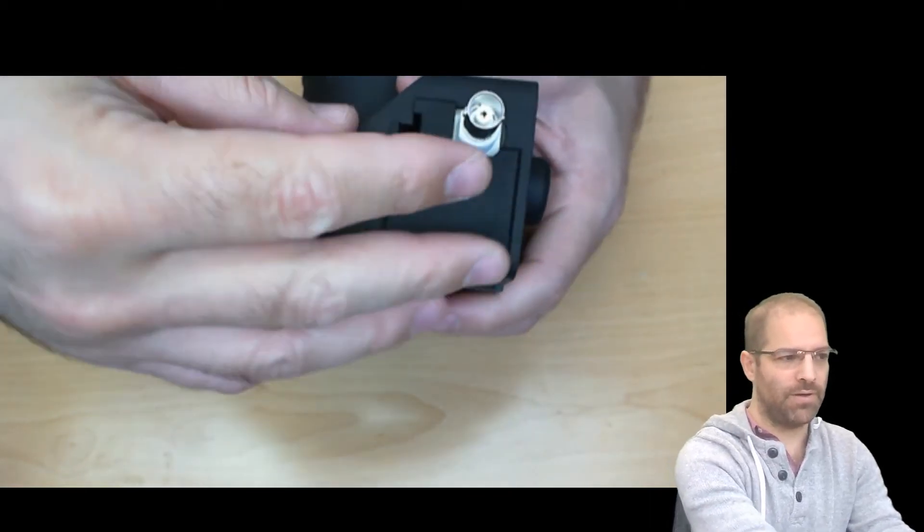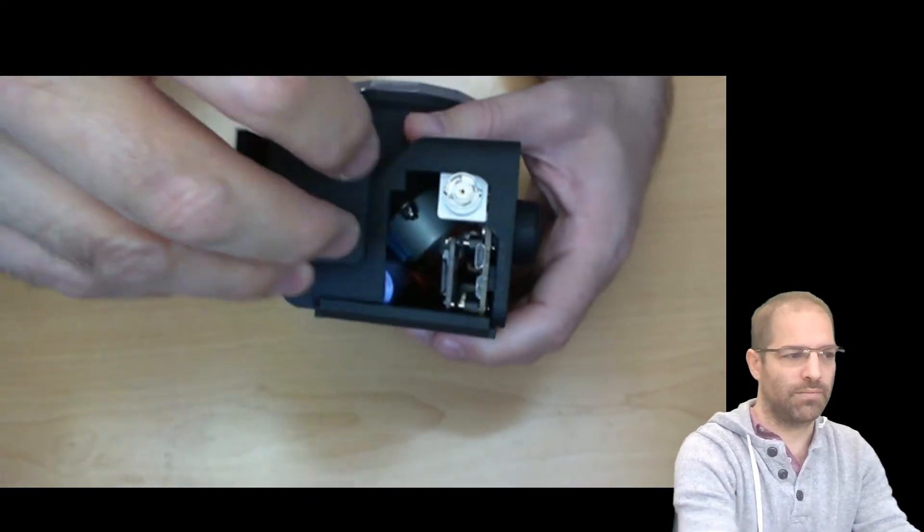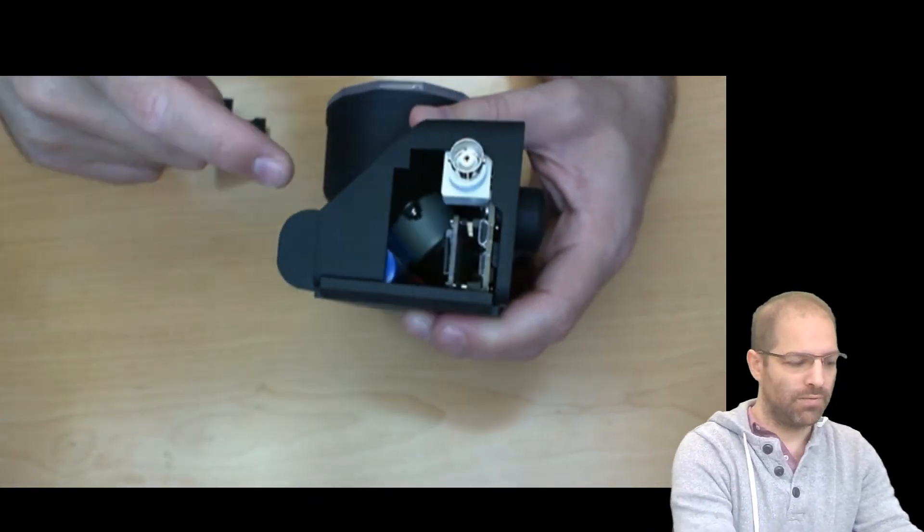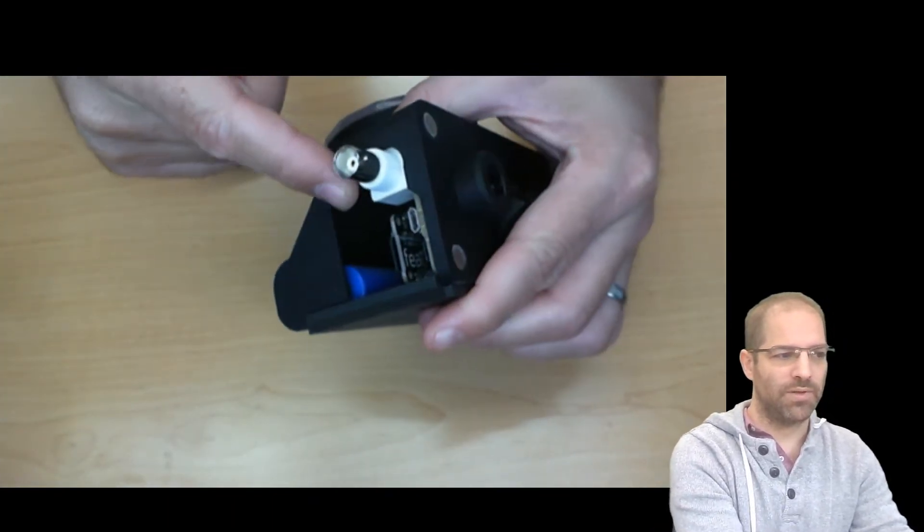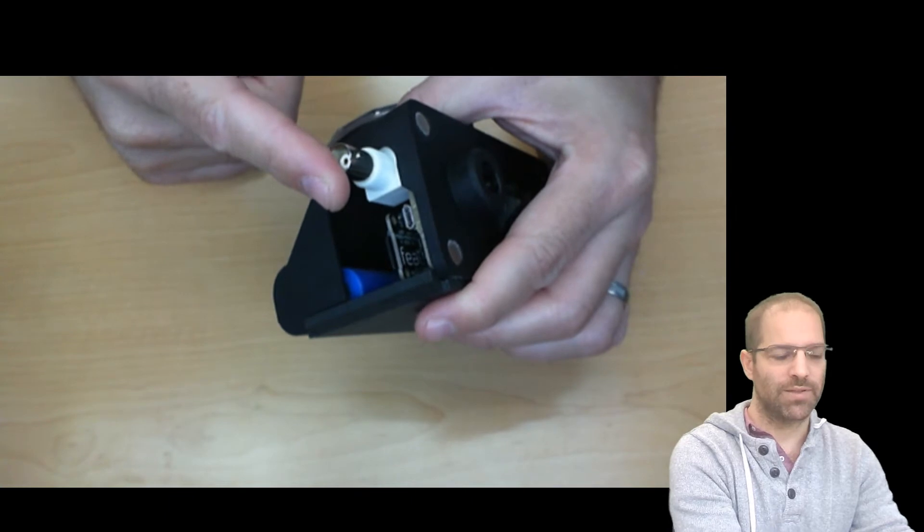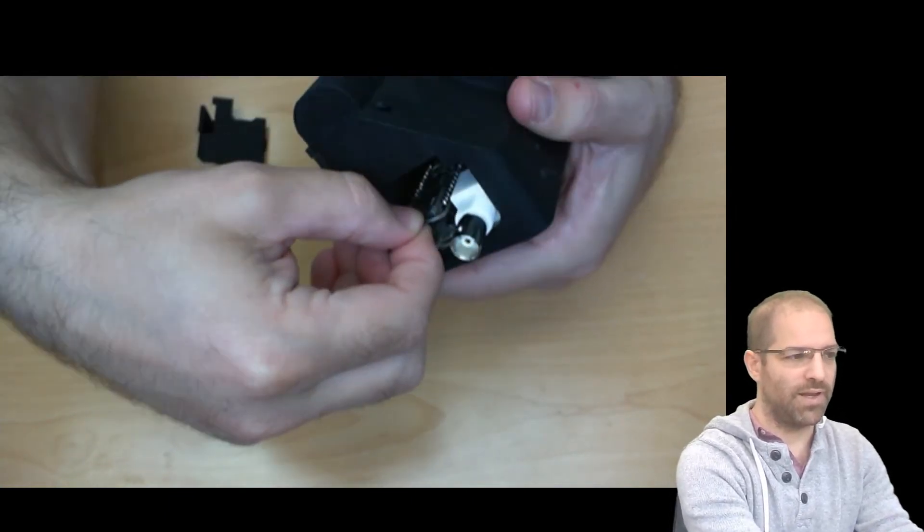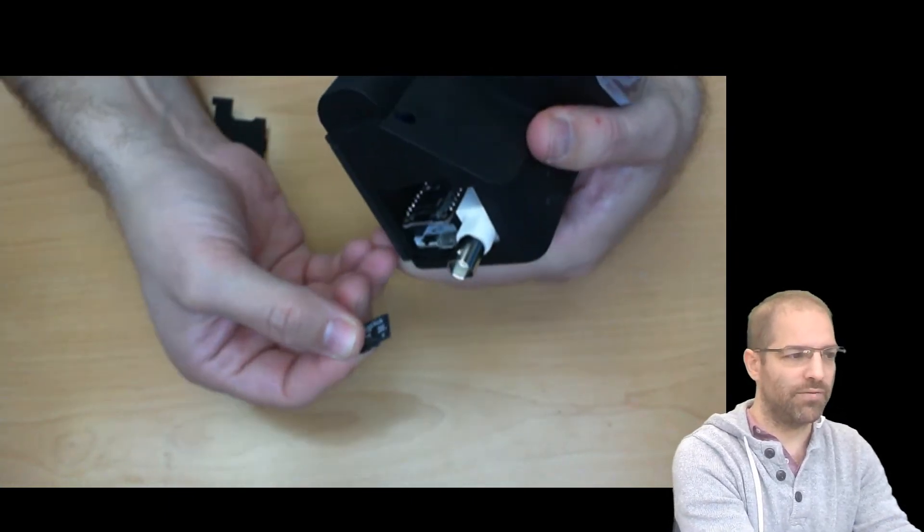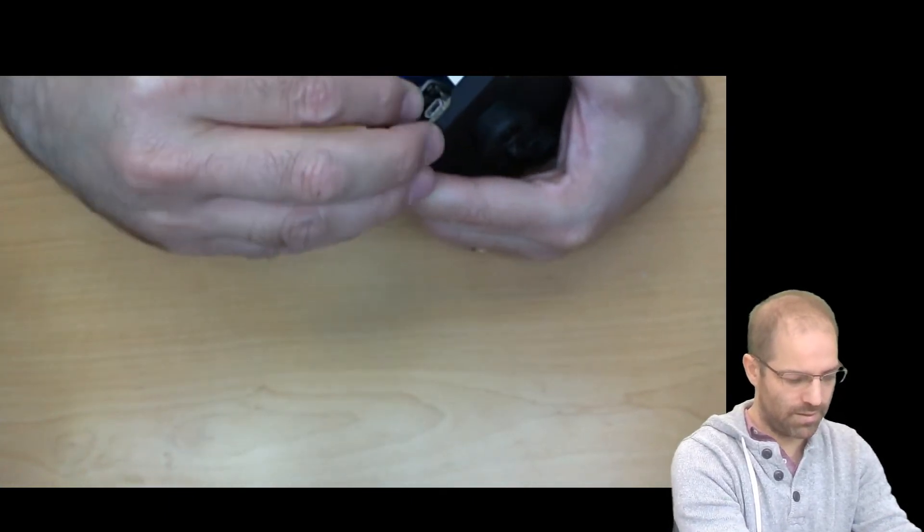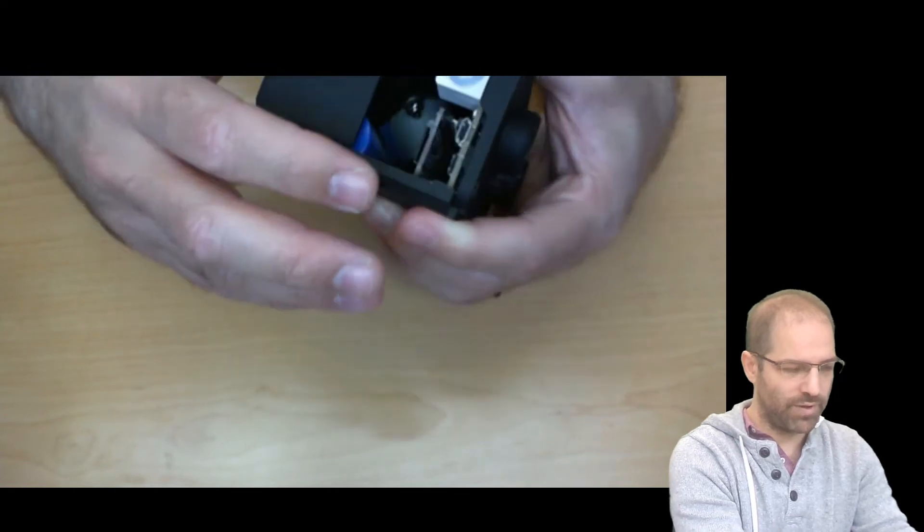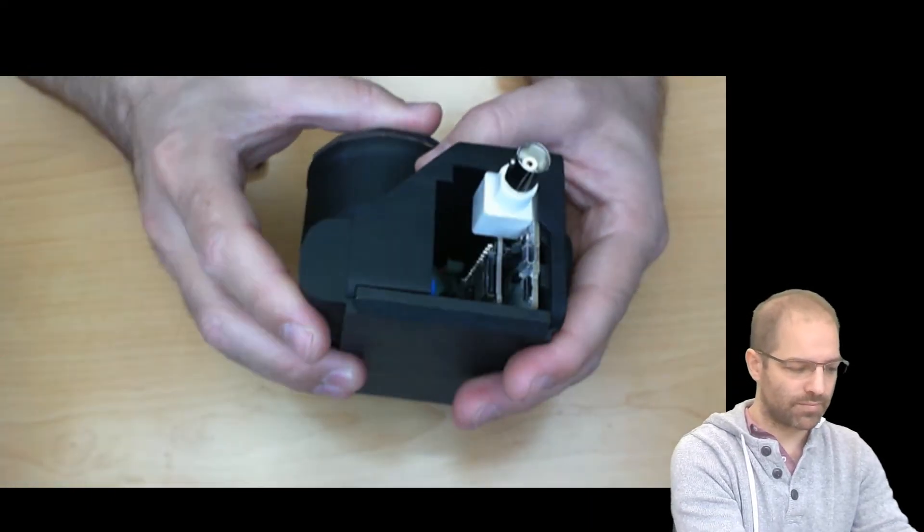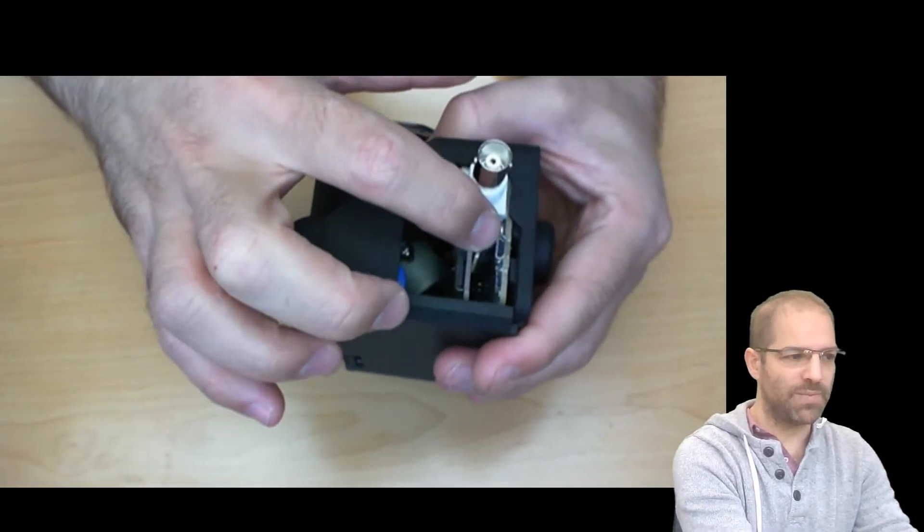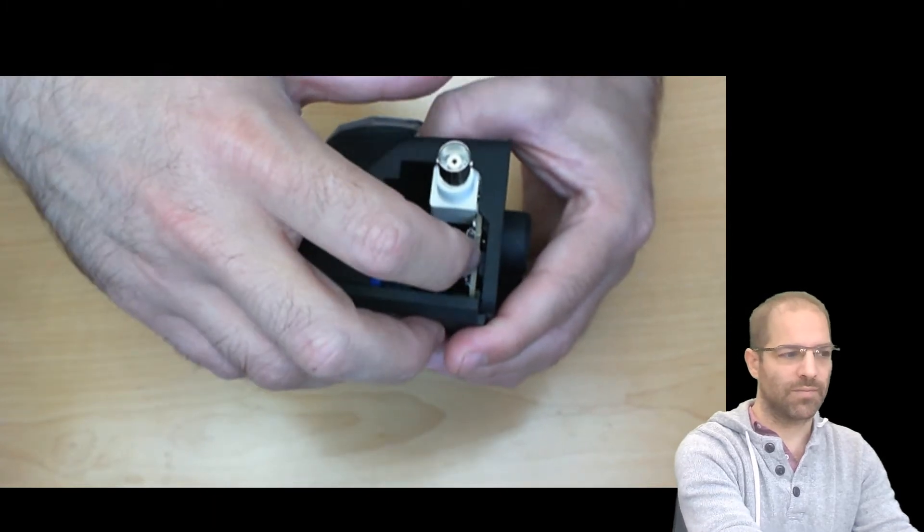We flip it over under this cover. We've got the BNC output for synchronizing with other equipment. We've got an SD card for storing all the data so every poke and every pellet are logged. We've got a USB port for charging, and we've got an on-off switch.